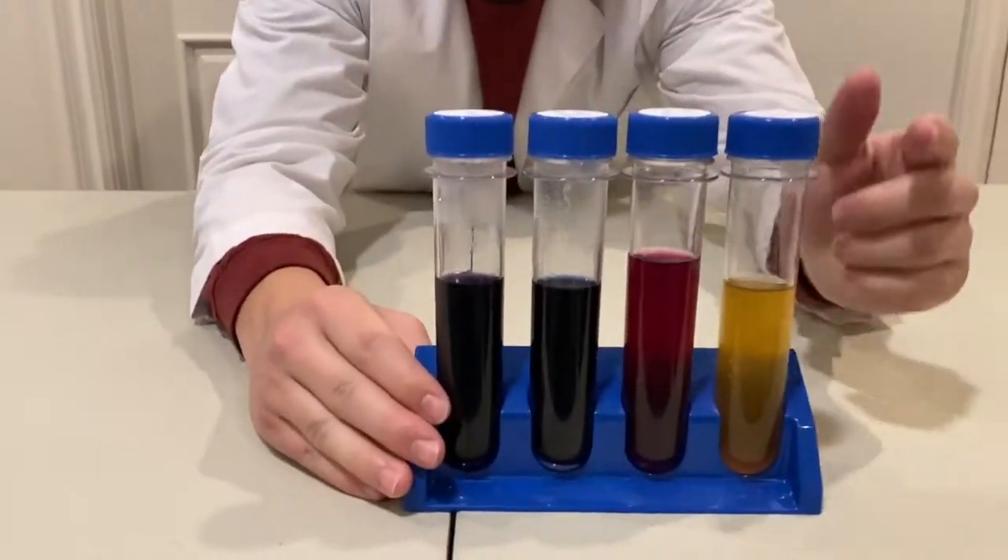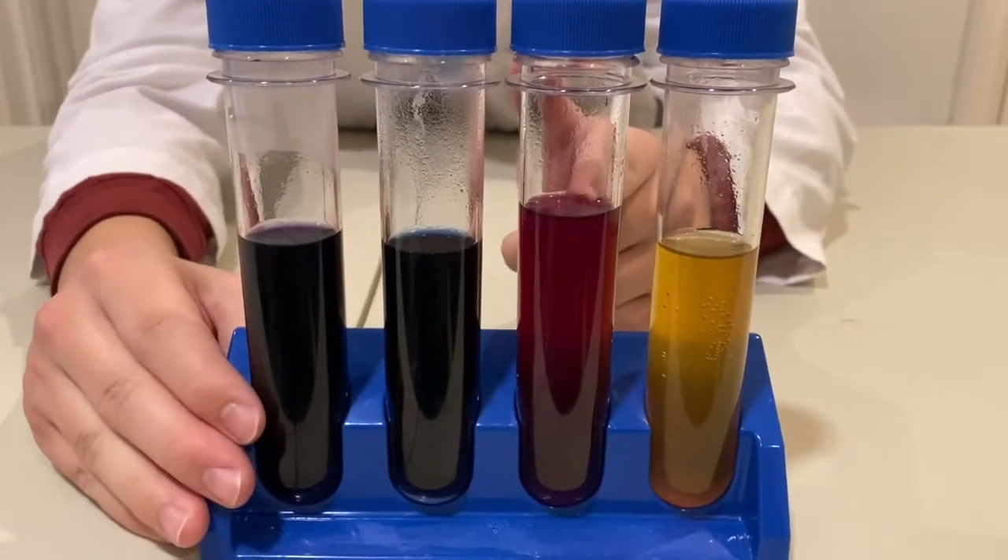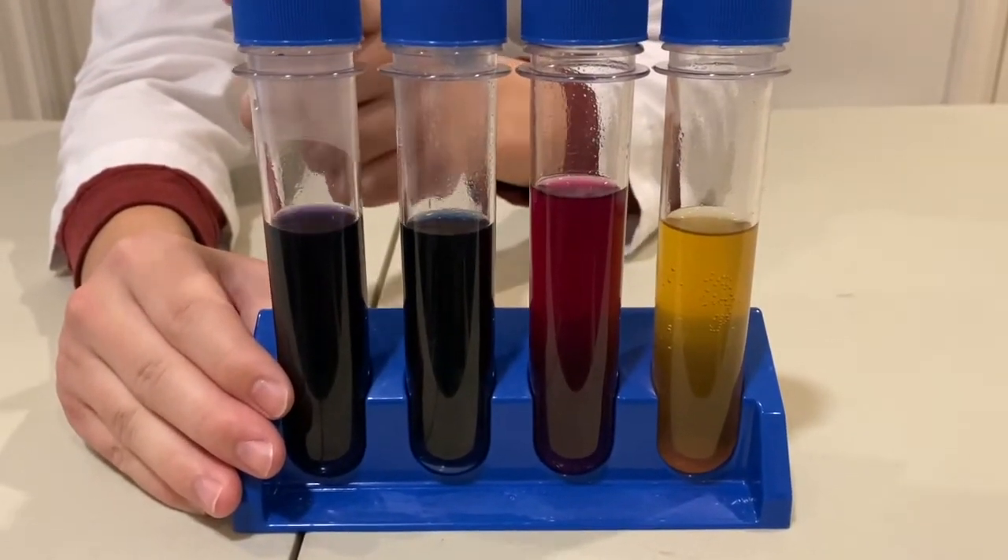If you zoom in on all of them, it goes: bleach, acetic acid, sodium bicarbonate, and the control.